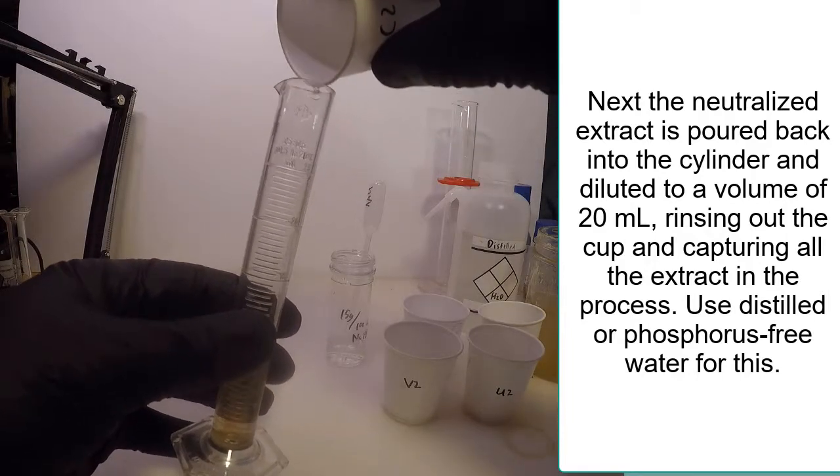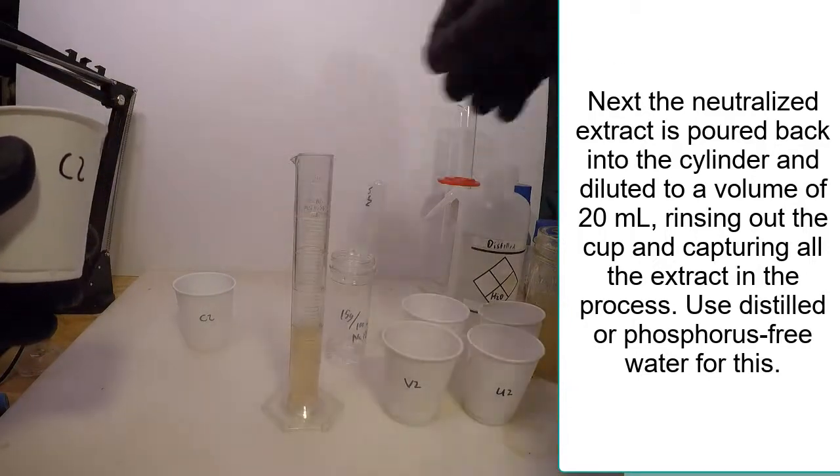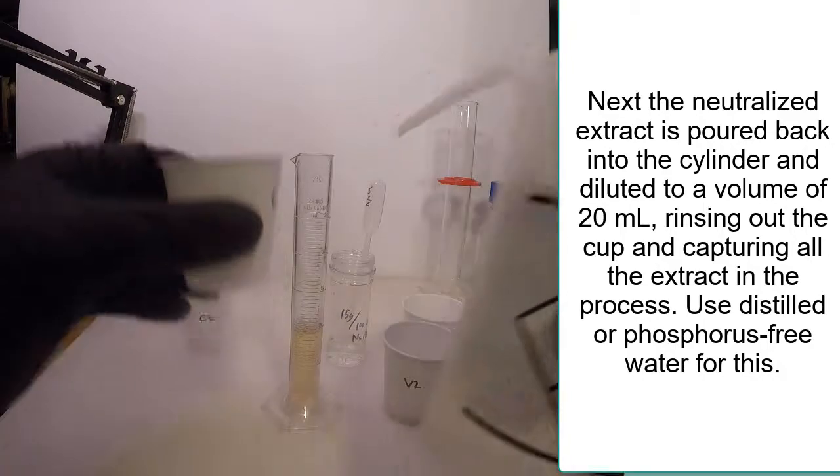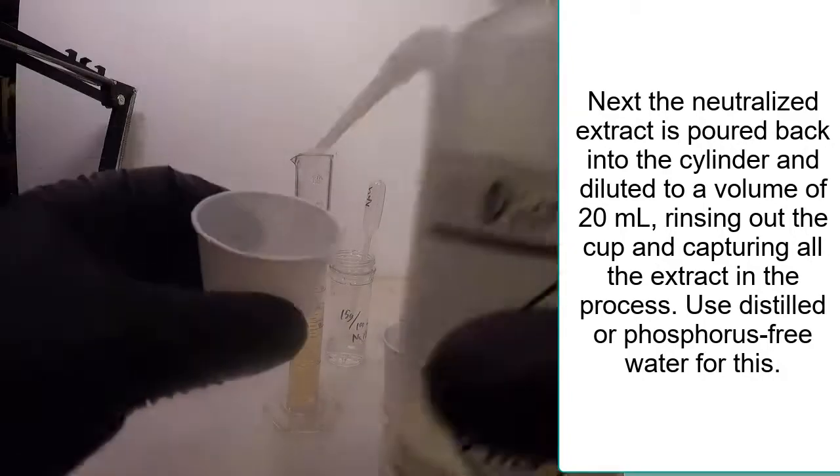The neutral extract is then diluted to 20 ml volume before analyzing. As this is done, the cup is also rinsed out using small amounts of distilled water.